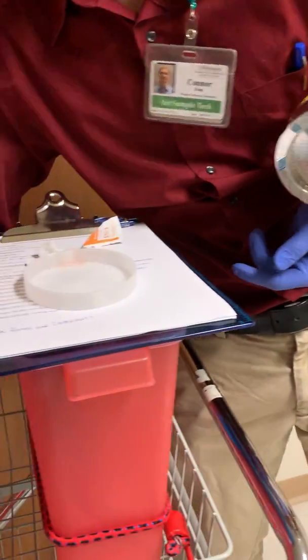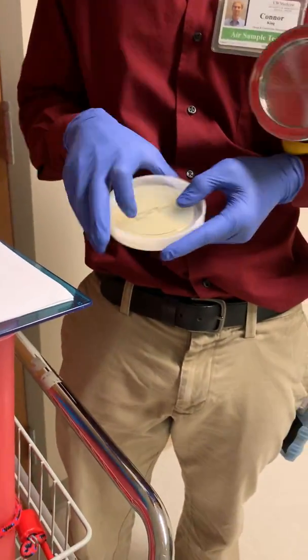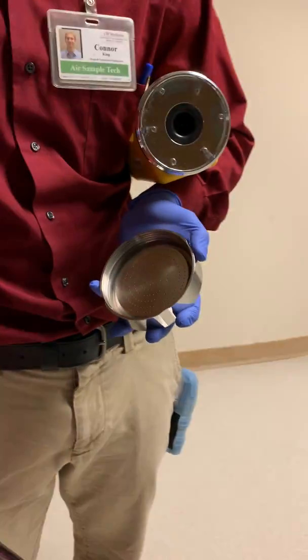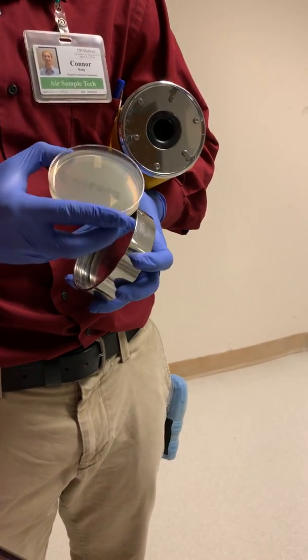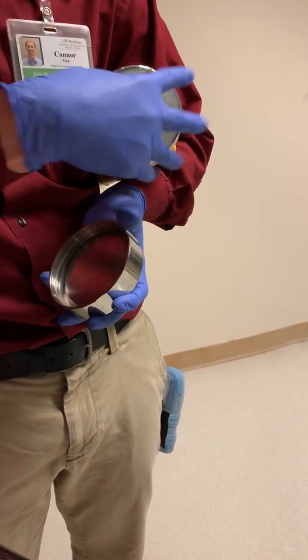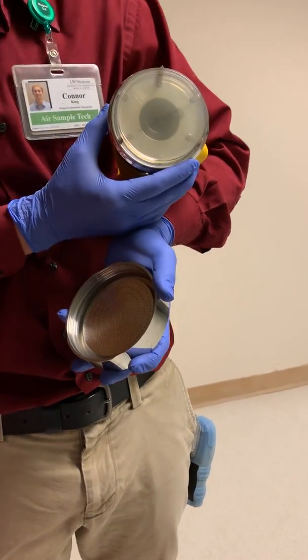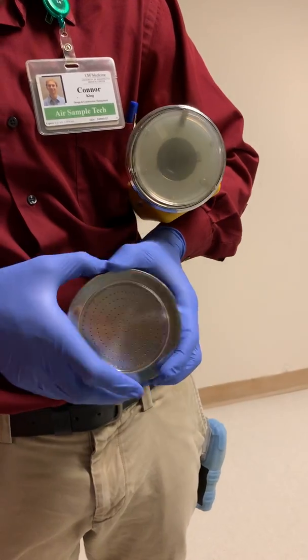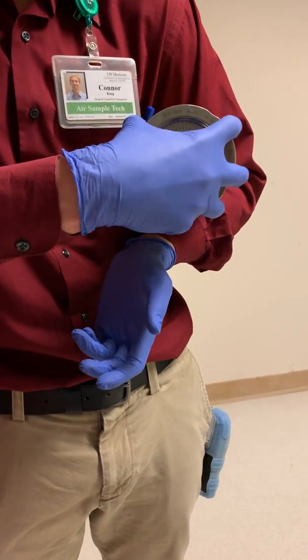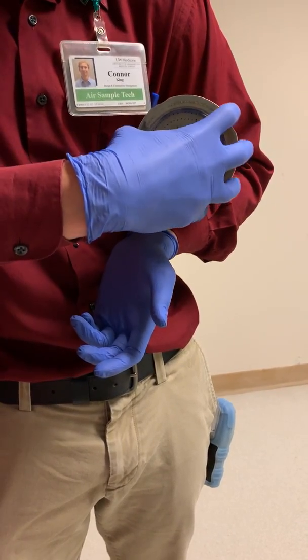We take a plate of inhibitory mold agar and place it gently inside the surface air sampler, like so. Make sure it's secure. Make sure there aren't any fingerprint marks on the plate because that can give you a false positive. Then you put it on flat — as flat as you can.